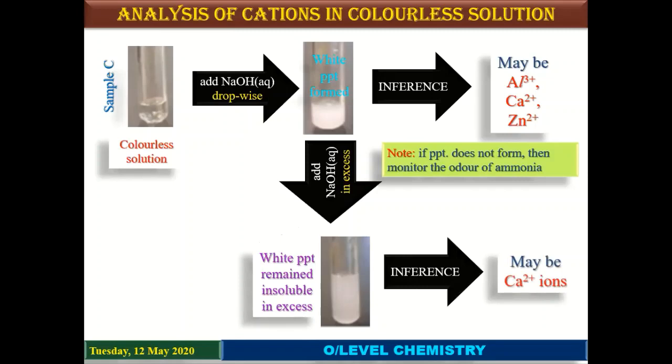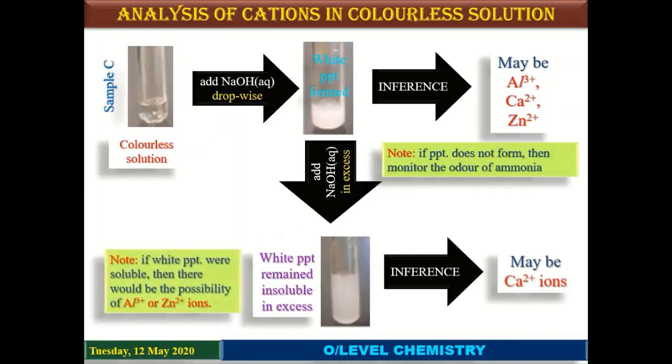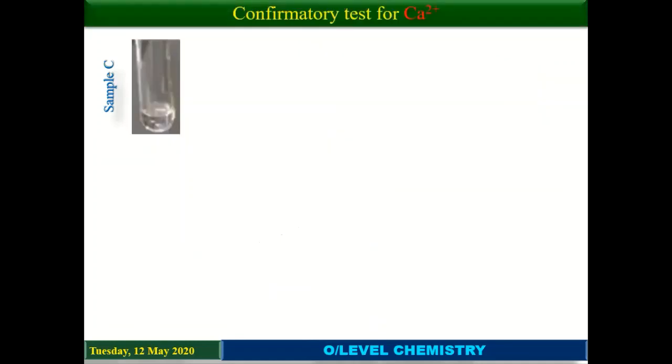So we will further confirm our result in the next slide by using ammonium hydroxide. And here notice it is similar to what we have seen in the previous slide. Sample C, again, for the confirmatory test for calcium ion.